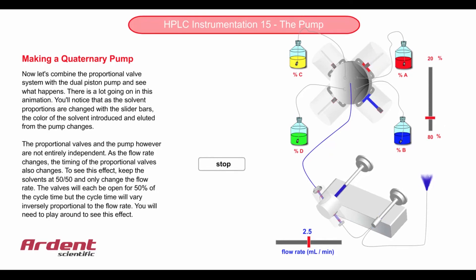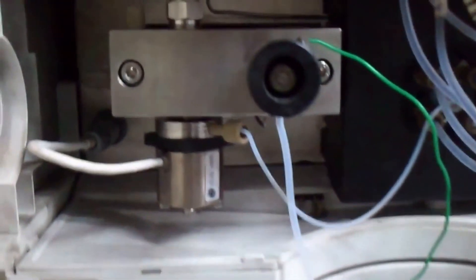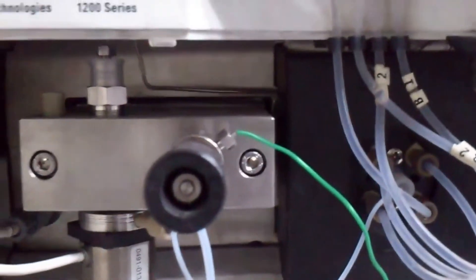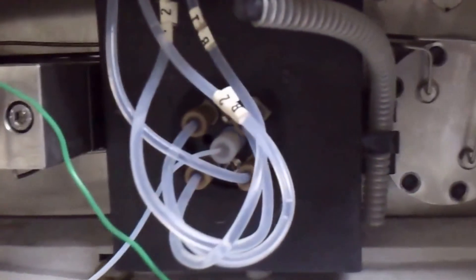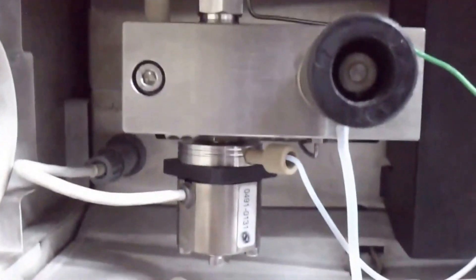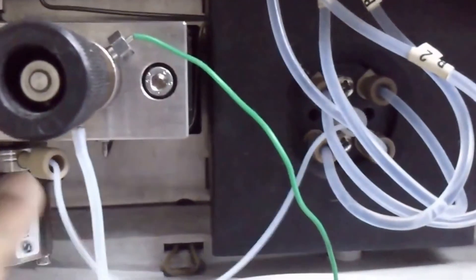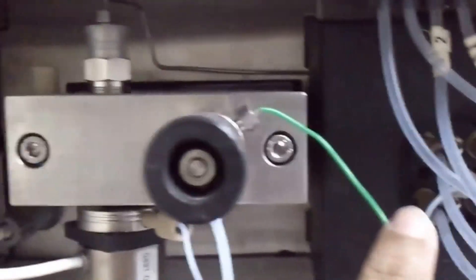Now let's see a quaternary pump in an actual HPLC instrument. We can see the pump unit on the left and the mixing chamber on the right. In the mixing chamber, we can see the four ports for the solvents and the port coming out from the chamber, delivering the mixture of solvents into the pump unit on the left.